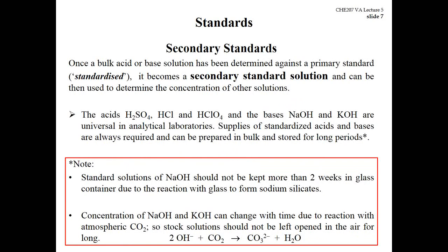In the lab, we often need large amounts of acid and base. So we can make a large amount of this solution and then standardize them with a primary standard. These solutions now become secondary standard solutions that can be used for the work in the lab.